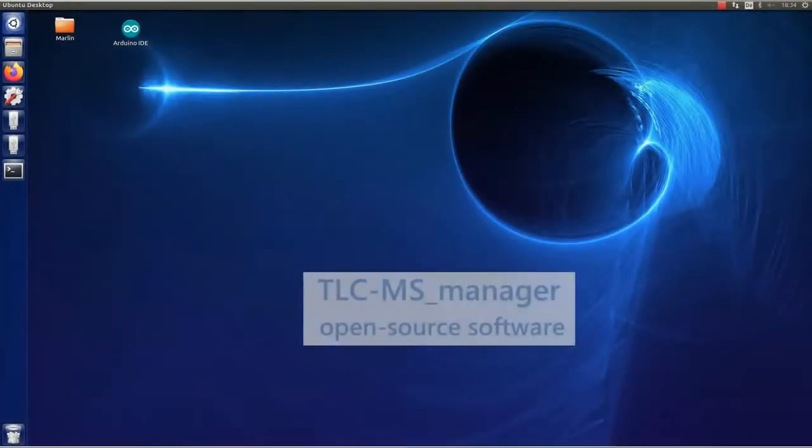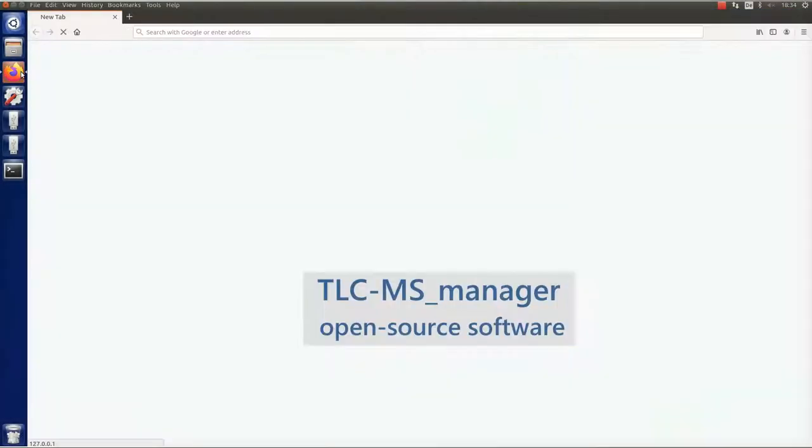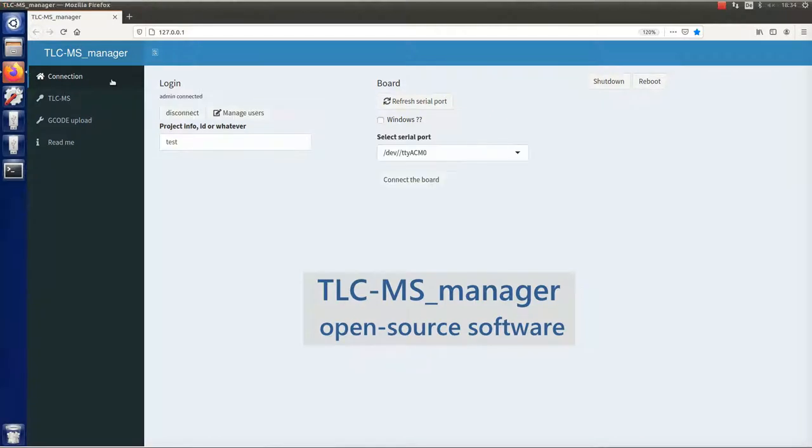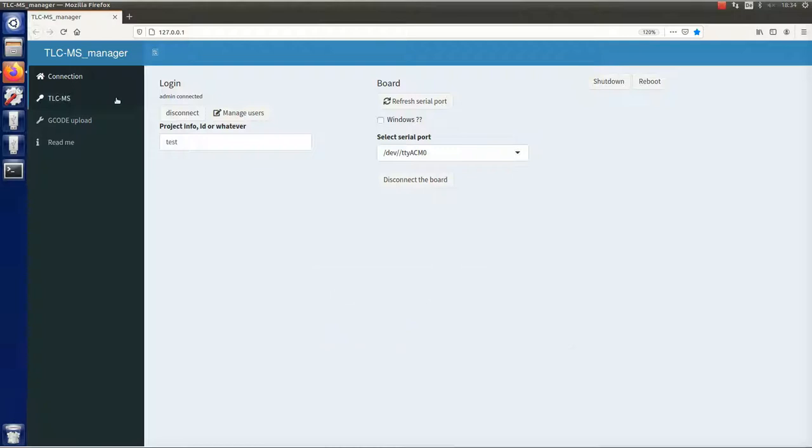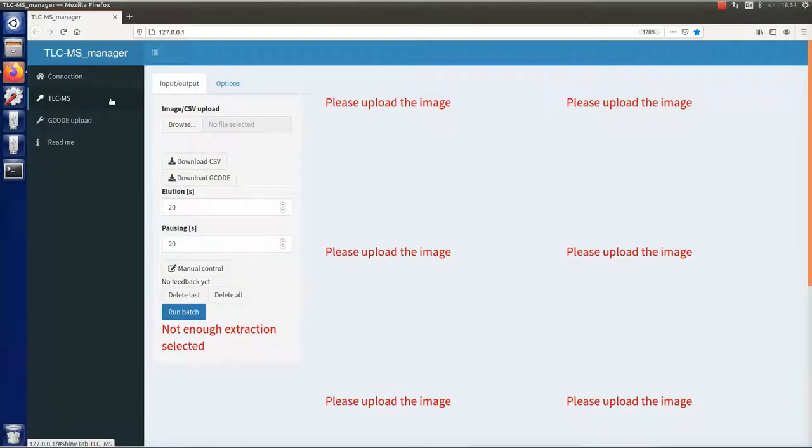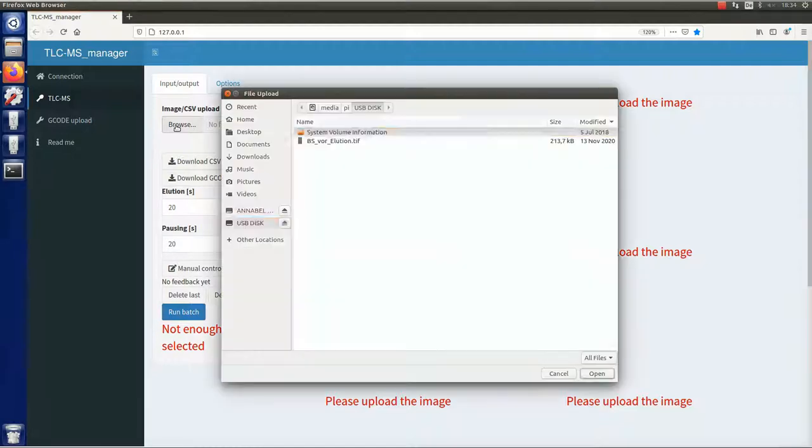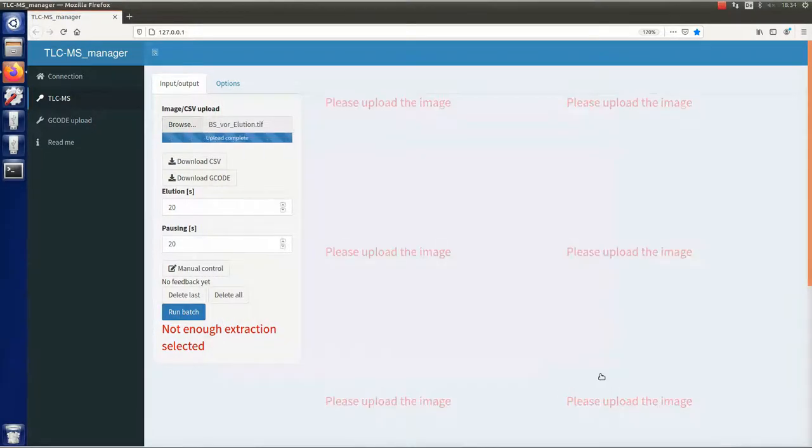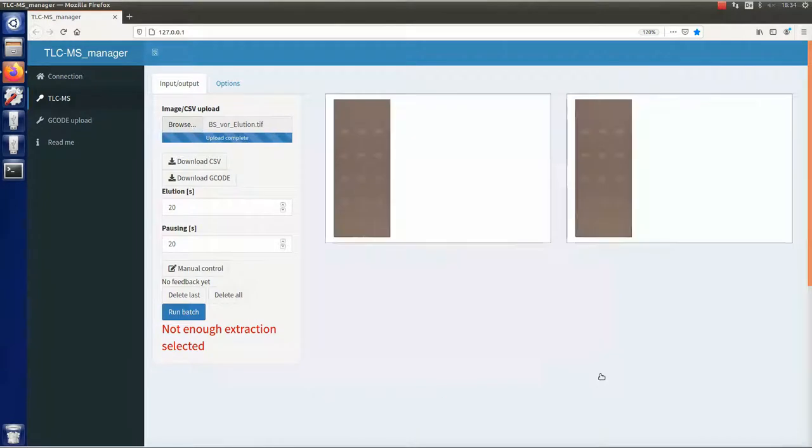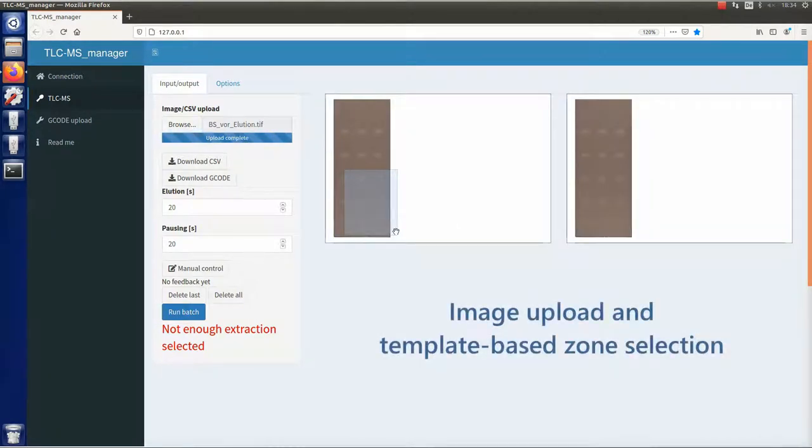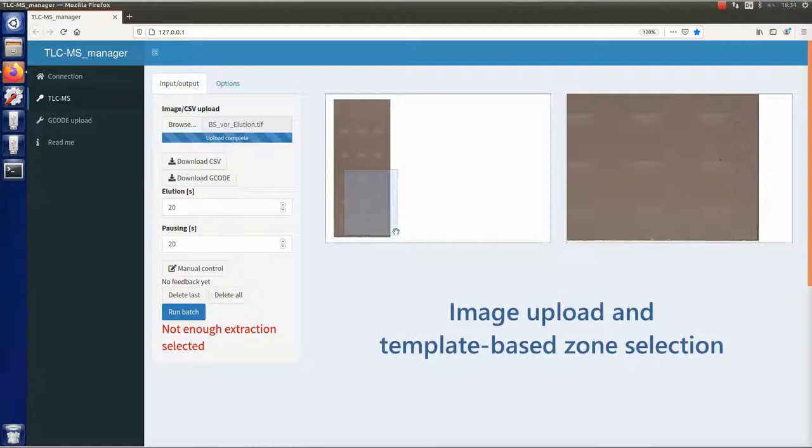The Auto-TLC LC-MS interface is controlled by open-source software termed TLC-MS Manager. The image of our template plate can be easily uploaded into the software. After selection of the interesting area on the left side, the area is displayed enhanced on the right side.